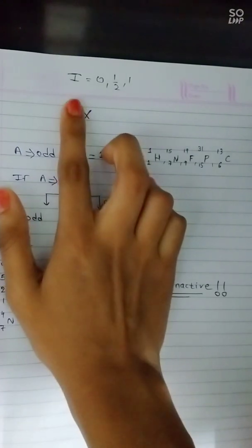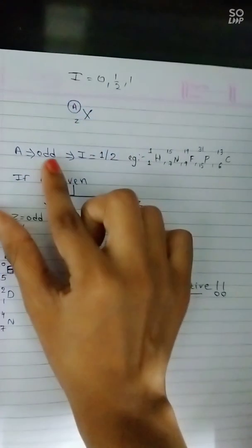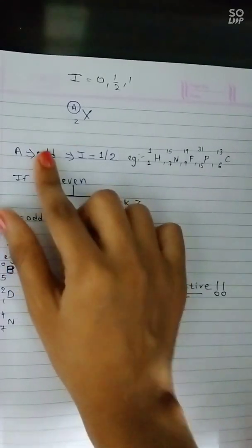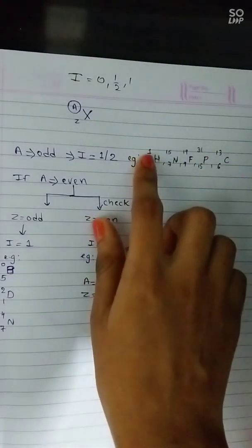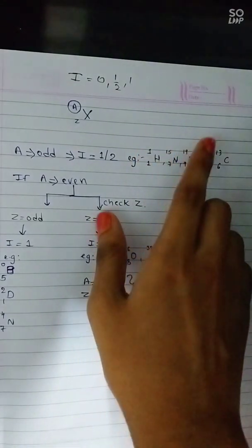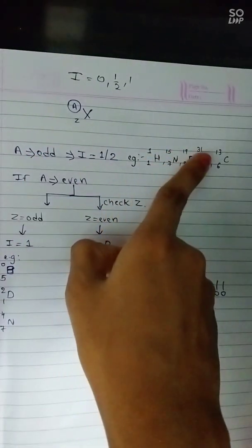Now, if A, that is atomic mass number, is odd, meaning it is having odd values, say I have given here examples like hydrogen, nitrogen, fluorine, phosphorus and carbon. Here just see this A. It is 1, 15, 19, 31 and 13. Means A is what? Odd. In every case it is odd.